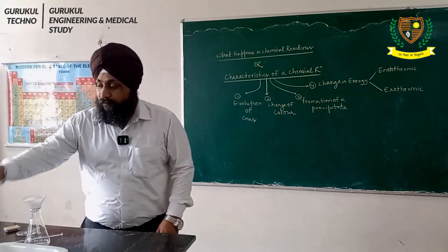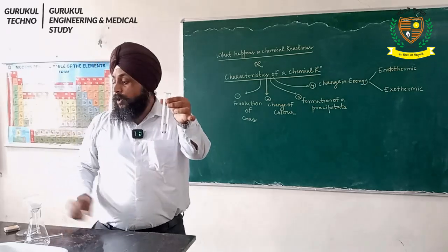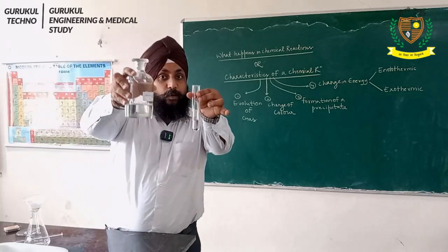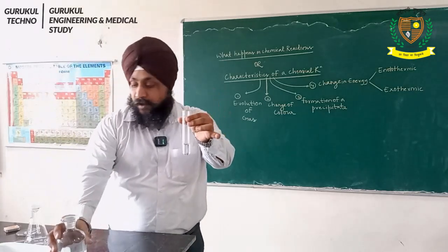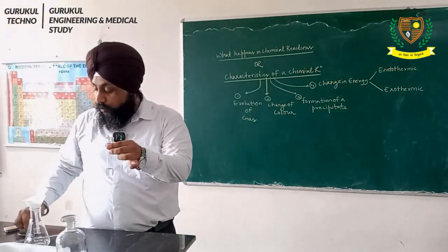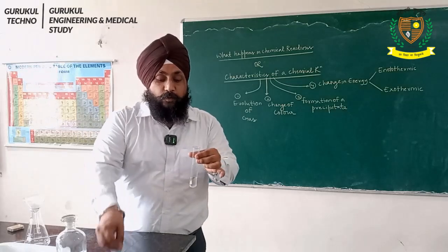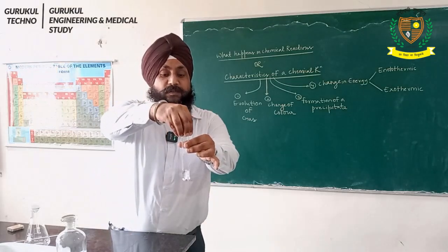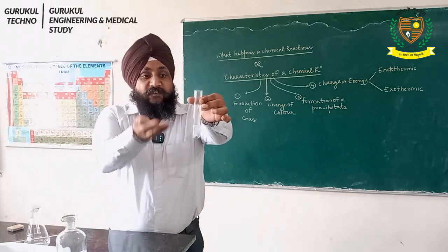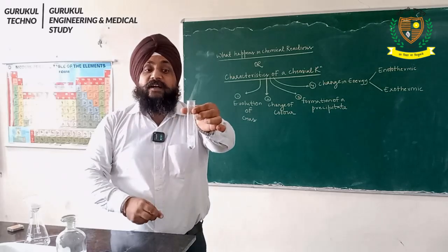So students, I have taken a test tube containing hydrochloric acid, and I am going to add some zinc granules to it. These are my zinc granules. Students, you will be able to see the effervescence of gas coming out. Yes, this gas is hydrogen gas.